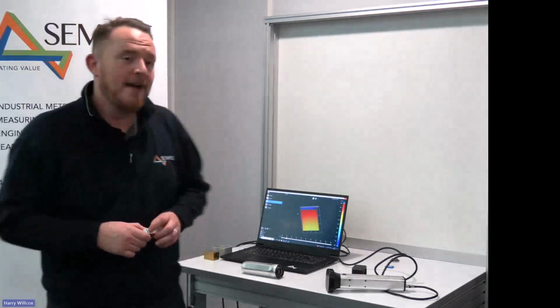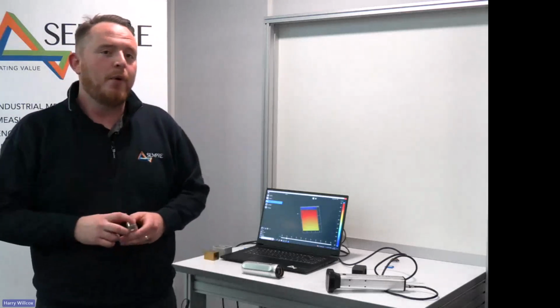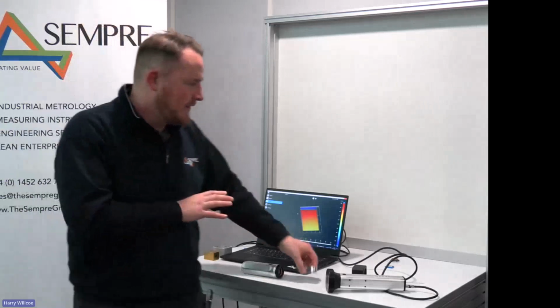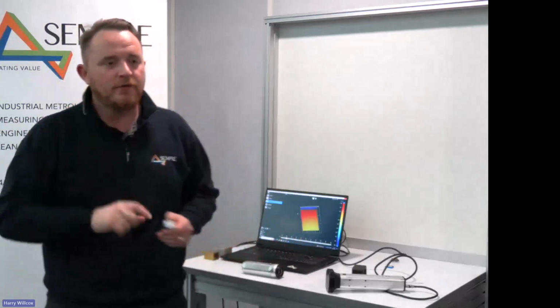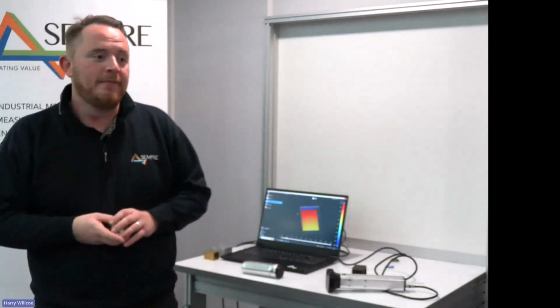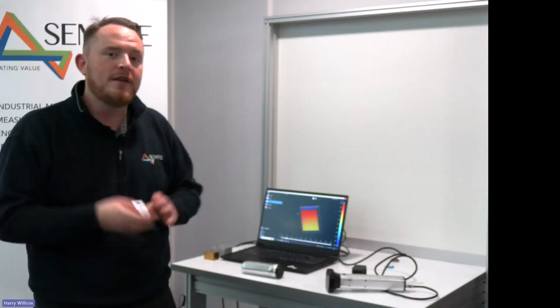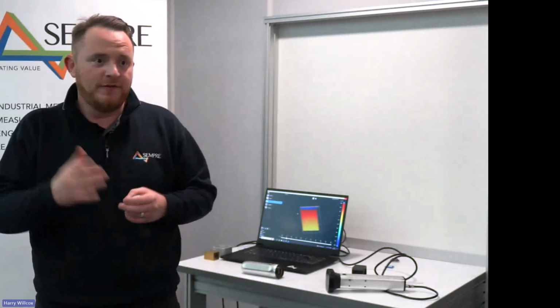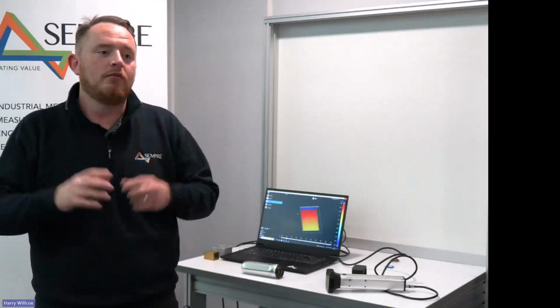The honest answer is I haven't tested it to a limit of going below 0.1 for access reasons. I think on the Gelsight Max, we've got a field of view of about 250 microns. So providing that you're happy with the resolution of the system in Z, which is obviously pretty incredible for a handheld unit at 0.3 of a micron, in theory, we should be able to measure down to sort of 50, 25 microns and get a reading.